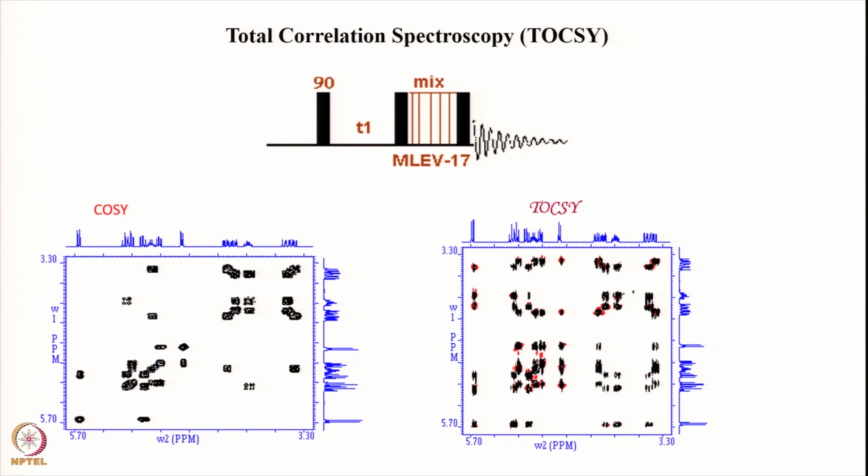Okay. Now in this case of course the resolutions are pretty good, although the intensity patterns are different in different peaks, and that is because of the magnitudes of the coupling constants, which results in partial cancellations of the intensities of these peaks. Now what is the particular advantage here further? Now you notice here, if we take the same proton, this is the TOCSY, you not only see these two as we saw here, okay, those two, you also see some other peaks there. And why does that happen?